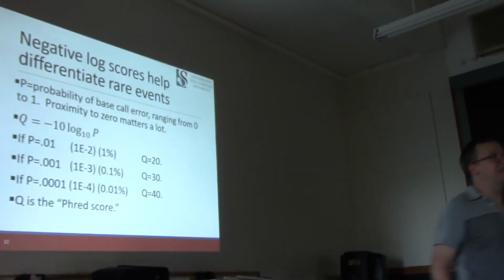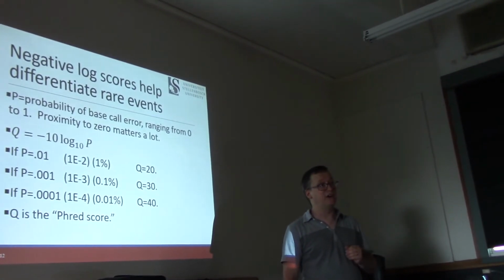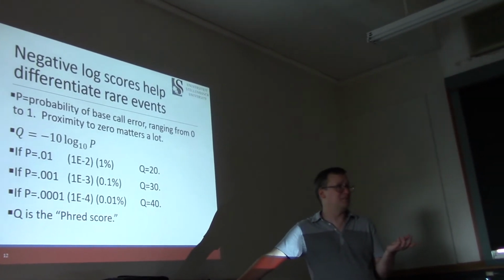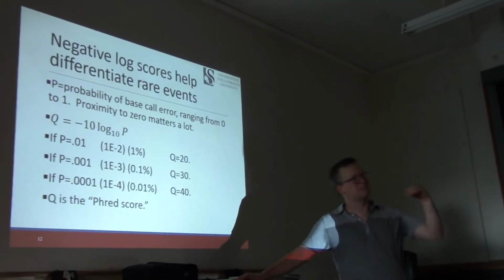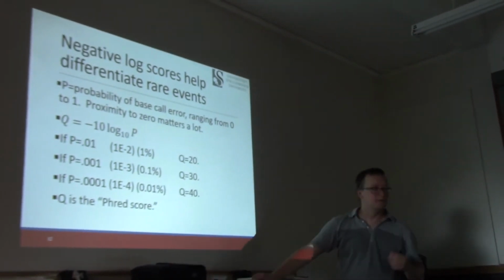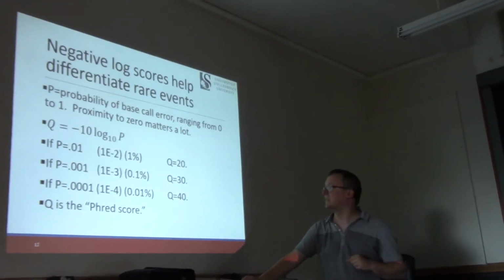So, we now need a way to express numbers that are very, very small. As you saw from that electropherogram, most of the peaks are pretty beautiful, really. I mean, most of them are right where we expect them to be. There's only that one color and not another color at that location. Its shape is pretty nice and concave down. It looks like a nice peak, etc. So we need to be able to talk about vanishingly small differences in the error rates for these peaks.